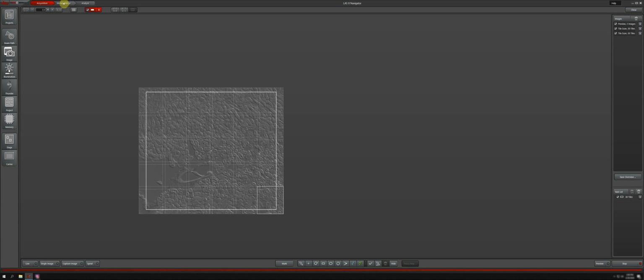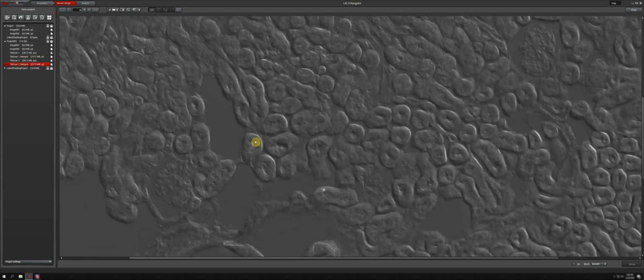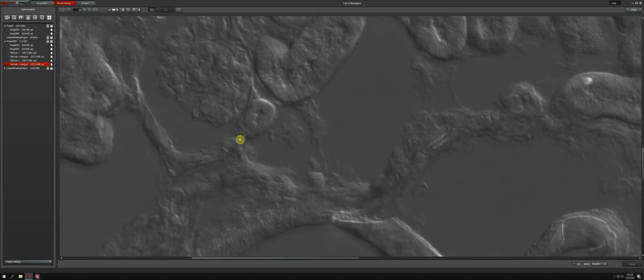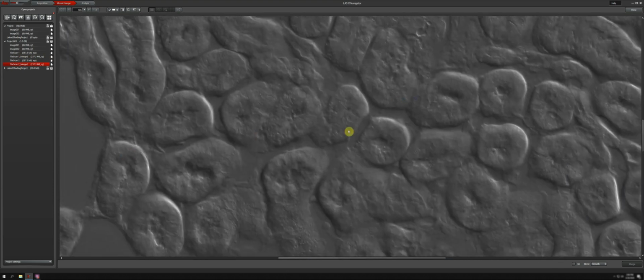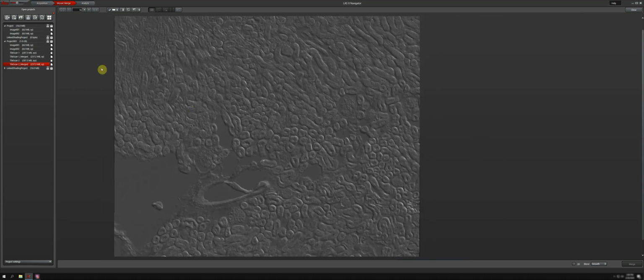And now looking at the stitched end results, we have it up here, and one down here. And now the shading is gone and the images are nicely stitched together. Just to show you the difference, this is the one with the shading correction, and this is the one where shading correction is not activated.